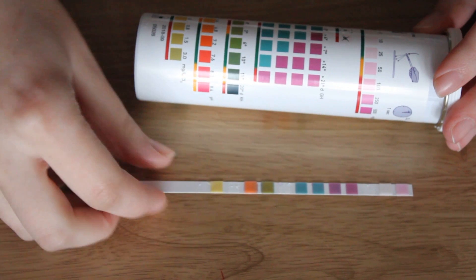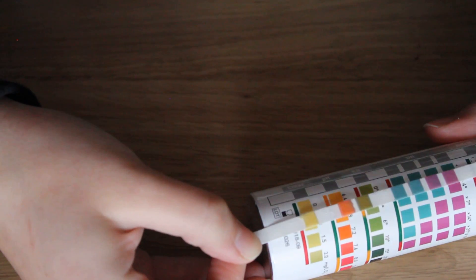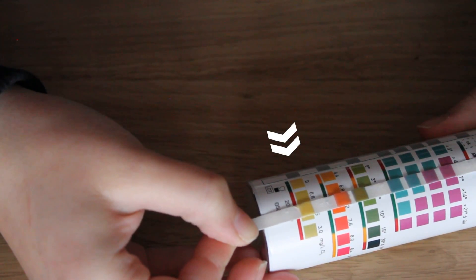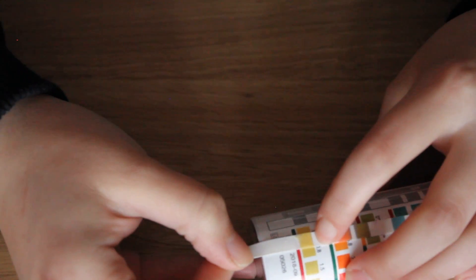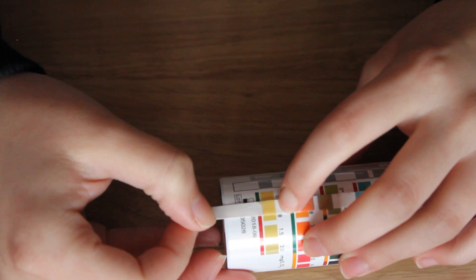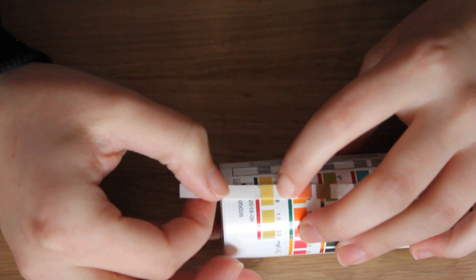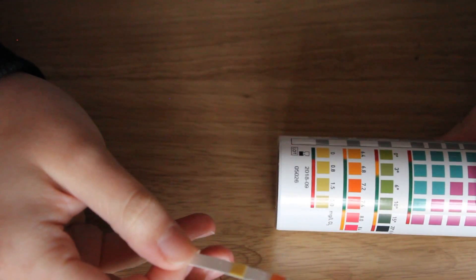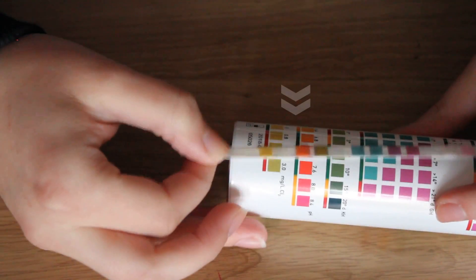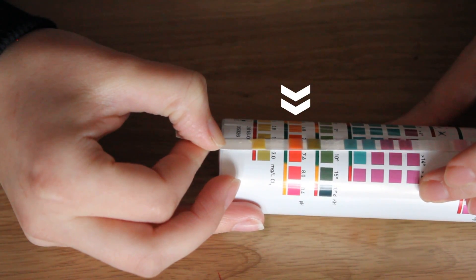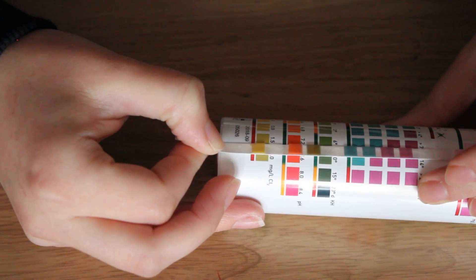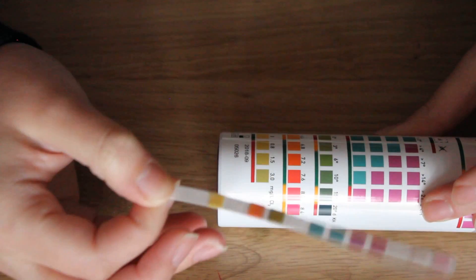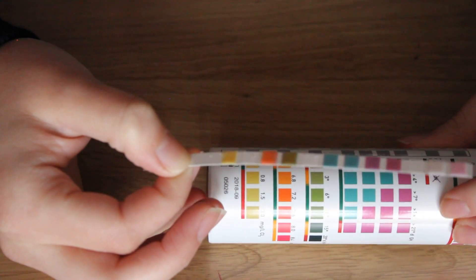The first one we will look at is chlorine. If we compare the first one I would say the chlorine is probably zero and that doesn't surprise me because I'm using quite a decent dechlorinator. The next one is pH, I would say this is around 6.8 to 7.2 which is pretty good.